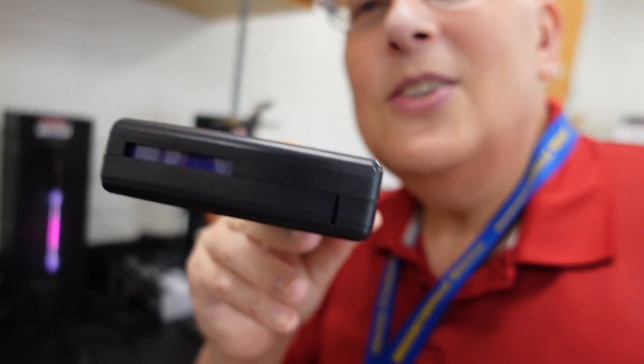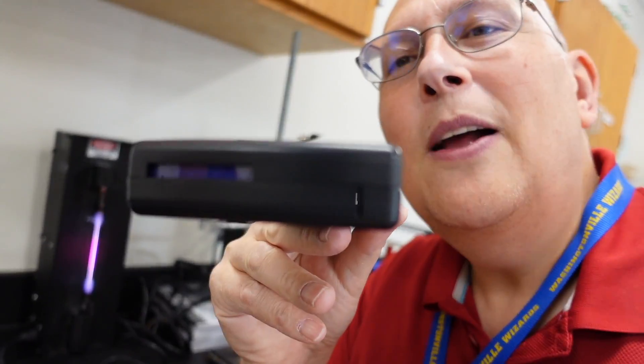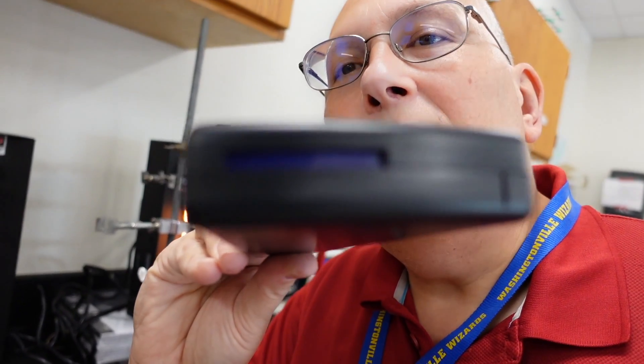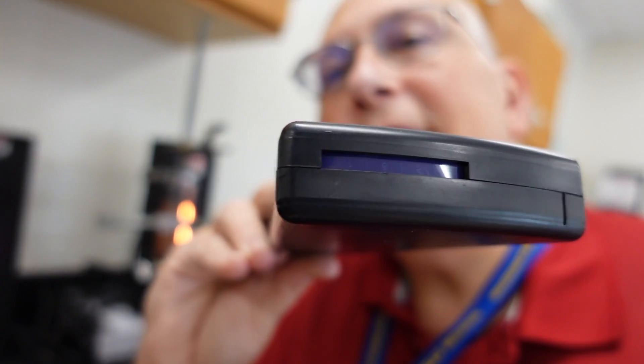The way it works is there's this little slit over here — see that little slit the light's just sort of flickering through? That little slit lets light through. And then on the other side, you see that piece of plastic right there? That's called diffraction grating, and what it does is it breaks the light up into a rainbow. But elements give off individual bright lines — they don't show a whole rainbow. And those bright lines are unique to every single element. They'll show up on this window right here on the front; there are actually numbers written on it that you'll be able to see from the other side.